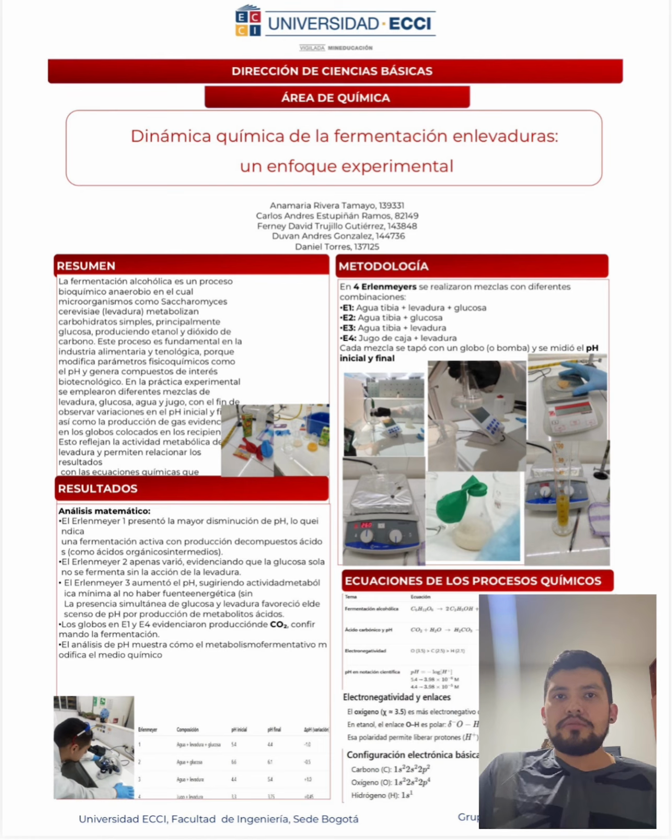In E4, with juice and yeast, we noticed a small increase in pH. This could be explained by the natural presence of buffering compounds in the juice. However, the balloon also inflated, showing that fermentation did occur, although in a different chemical environment compared to E1.